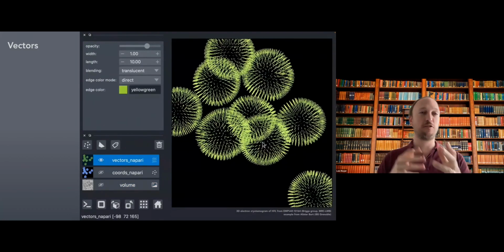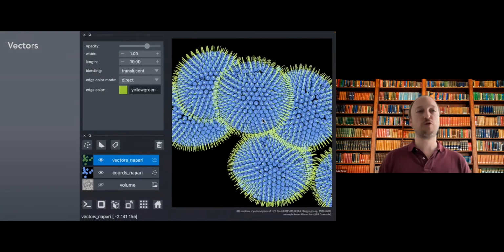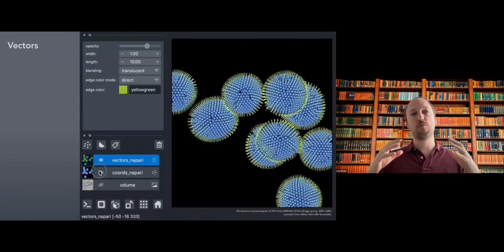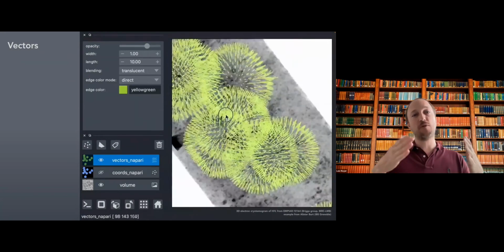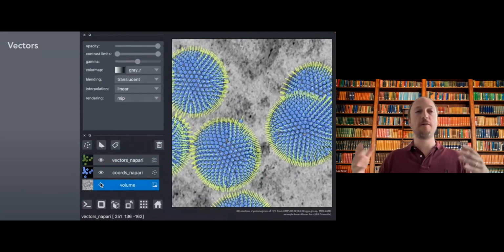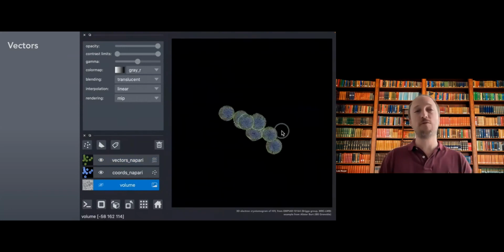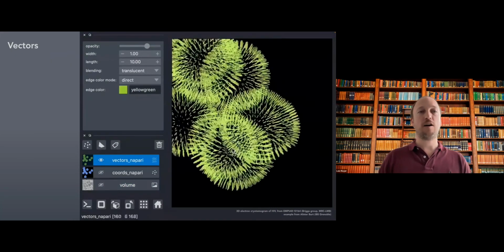It's fantastic, he posted that on Twitter, and we were all very excited because it's a beautiful application of how you can combine 3 different kinds of layers to not only showcase the data itself, but also the result of multiple steps of analysis potentially, right? And then show that all together in a very easy way. When you look at the code in the end, it's very little code to actually achieve that.